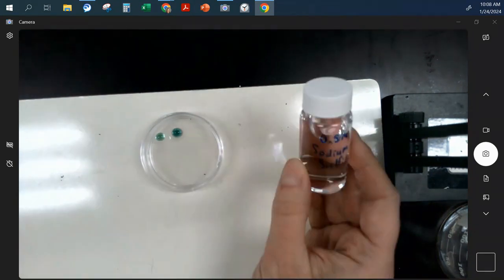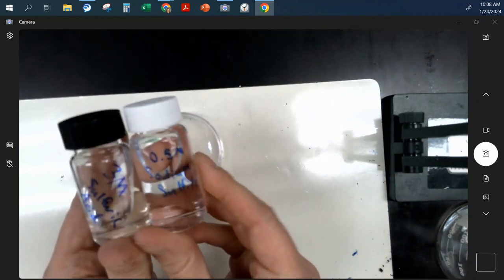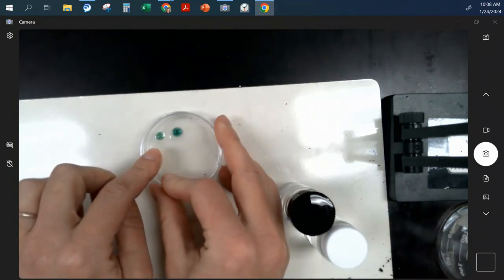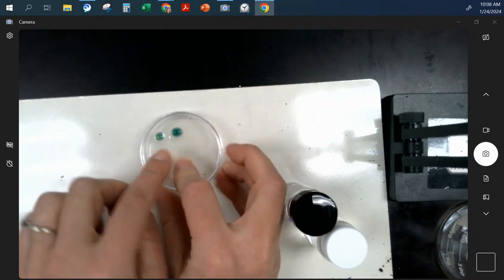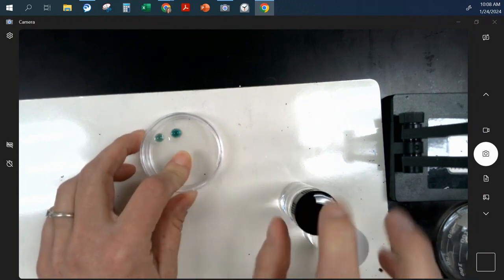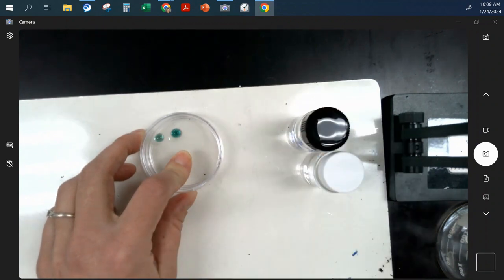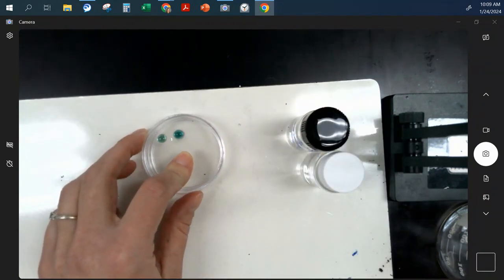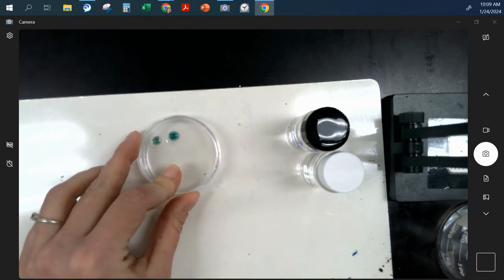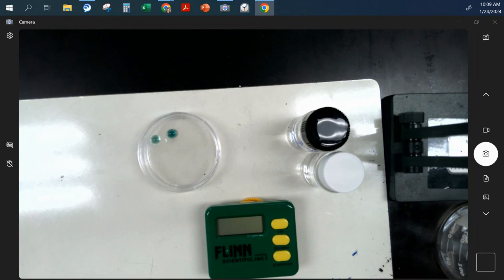Then I'm going to put these two chemicals next to this dot, this indicator. The indicator is going to measure the pH. The outer one is going to tell me what it started as, and then the green dot on the inside is going to tell me the pH. This is a universal indicator. It's going to go through a range of colors. Maybe do this one once and see what happens when you do the lab. You're going to try to time and see how fast it takes the color to change, okay?